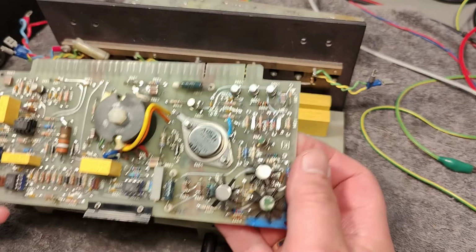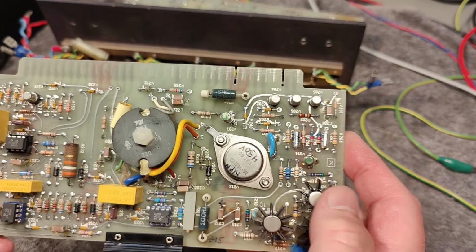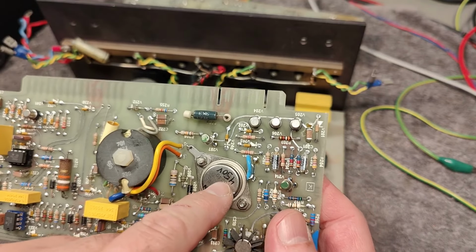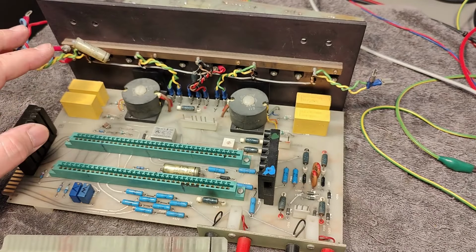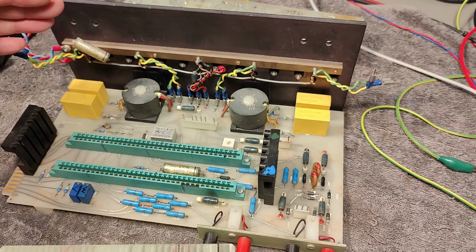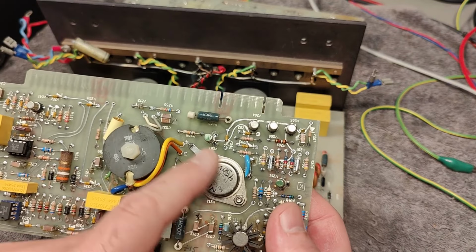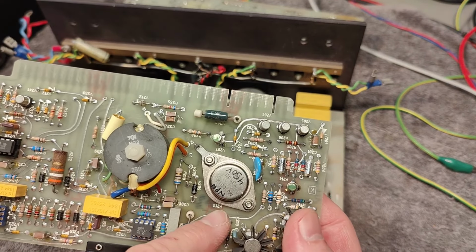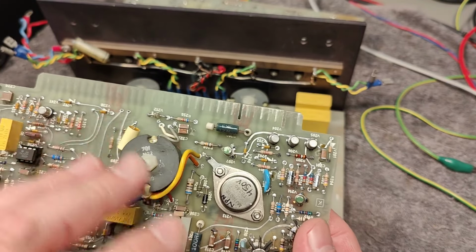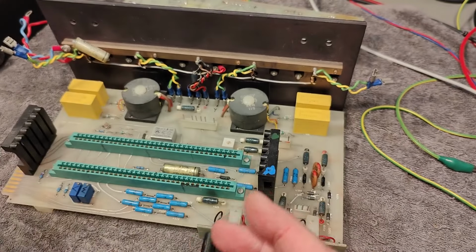So this is, remember, the power supply. I changed this transistor on the power supply because this one is exactly the same type as the rest of the transistors in my power drive, and I just wanted all 5 of those to be the correct type. So here it's really not that critical. I just put in one that can do a lot more high voltage for this one, so it's perfectly fine. And I tested this one, it is now working fine, and now I got my spare transistor.